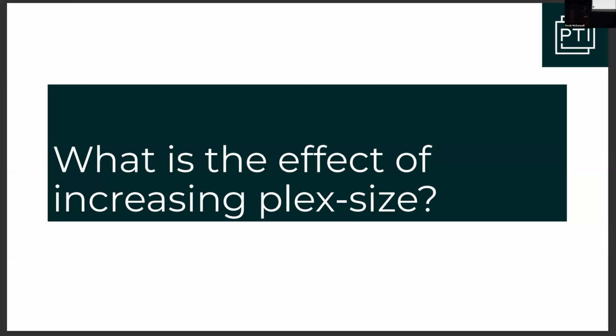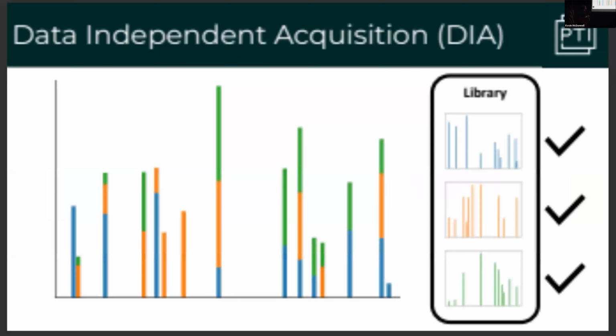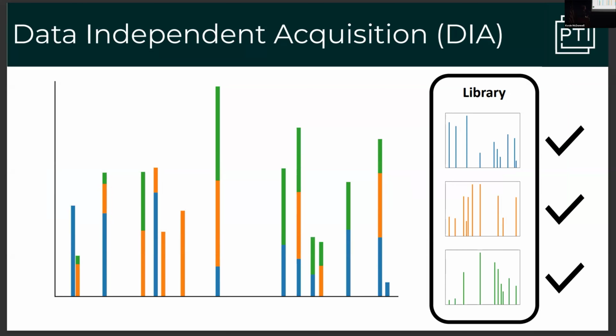And just to talk about the effect of this, we've talked about this in DIA. We're parallelizing the number of peptides in a particular spectrum. We may have different peptides in our library, and all of these are present. This is a cartoon, but it illustrates the case.